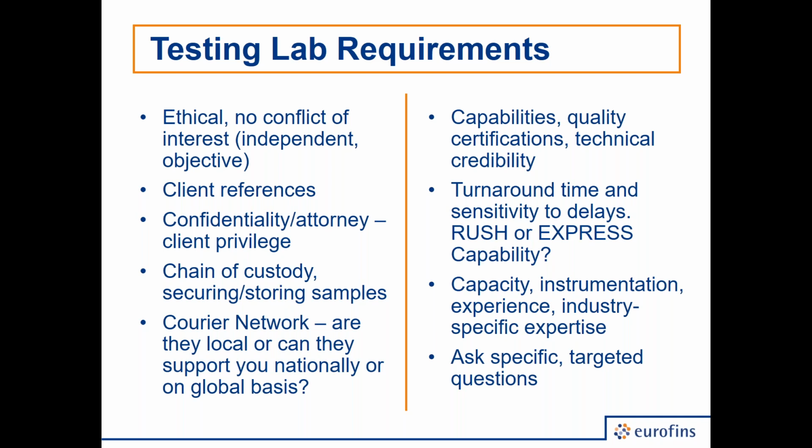You always want to ask about capabilities and quality certifications. Those are things like ISO 17025 and USDA licenses. Are you registered with the Food and Drug Administration? Are you compliant with 21 CFR Part 111 for dietary supplements, Part 210 and Part 211 for pharmaceuticals, medical devices, and OTC compounds? Other types of accreditations. Can you handle biohazard class 1 or 2 substances? Can you bring in plants, seeds, tissues, blood, plasma, serum?